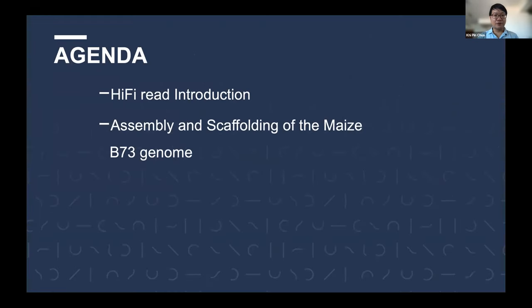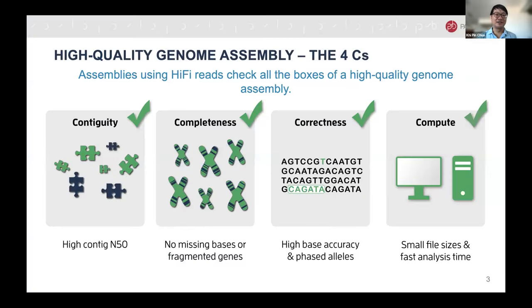So the agenda for my talk will be a very quick introduction of HiFi read. This has been introduced by Paul just now as well, so I will not spend too much time on it. And for the technical part, I will be going through with you an assembly and scaffolding of the maize B73 genome, of which the HiFi data is actually available publicly. So you can go through whatever I will talk about in the slides on your own if you are interested to try this.